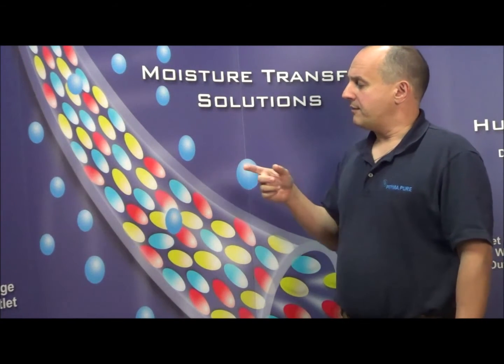The membrane works on the basis of differential vapor pressure. So if the vapor pressure inside of the tube is higher than outside the tube, the moisture automatically moves from the inside to the outside.